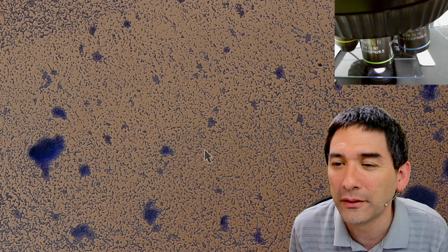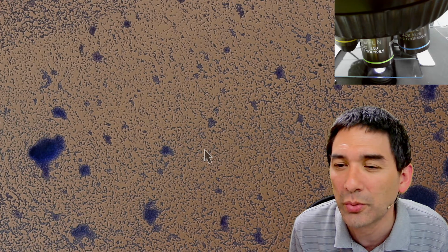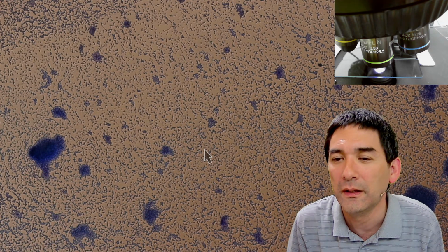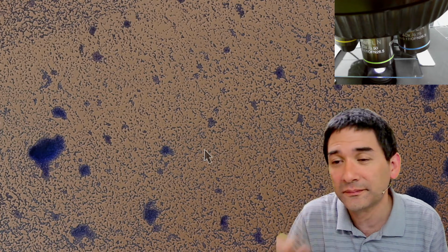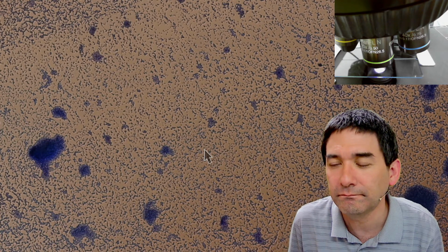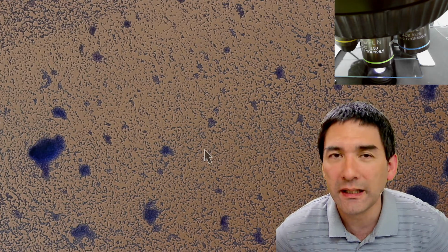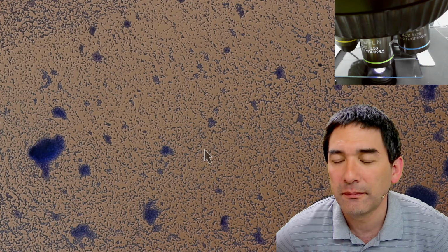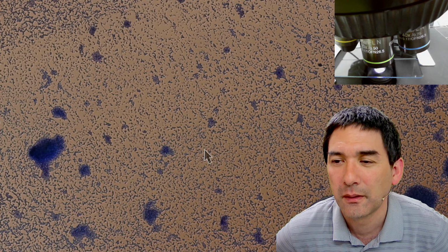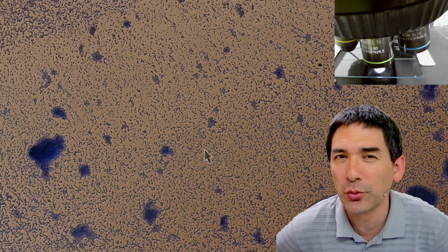Have you ever bought a cheap microscope that was better than expected, or an expensive microscope that was way worse than you expected? That's an interesting one. Let's put it this way, you do get a little bit what you pay for, but from the optical quality, the microscopes were not so different.